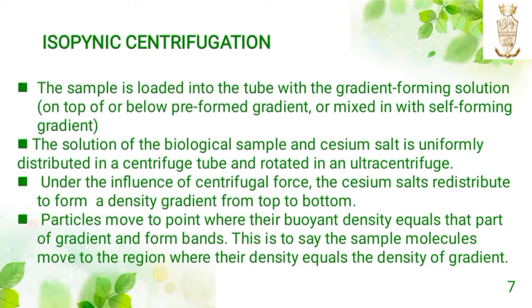Then isopycnic centrifugation. The sample is loaded into the tube with a gradient forming solution on top of or below a preformed gradient, or mixed with a self-forming gradient.